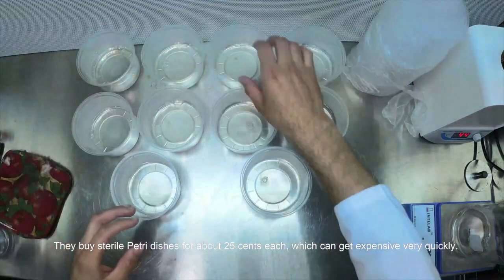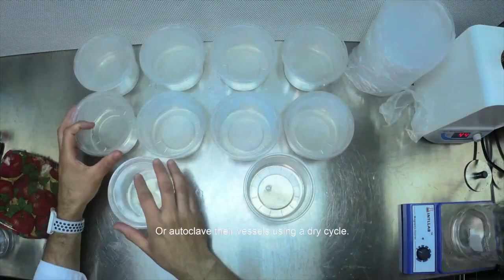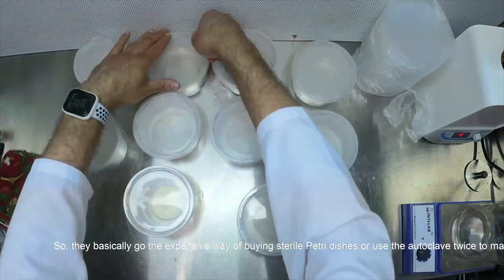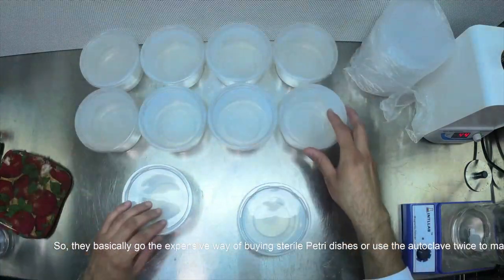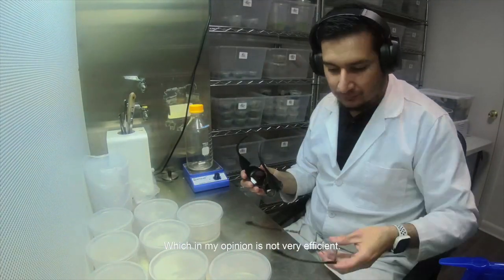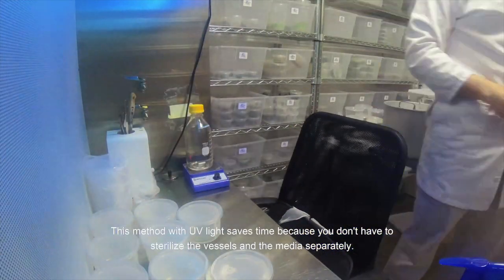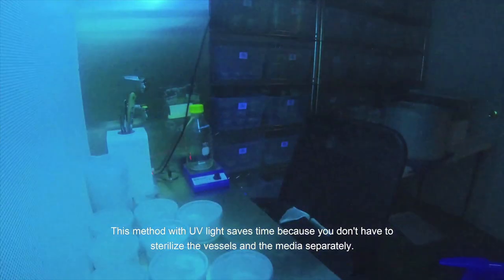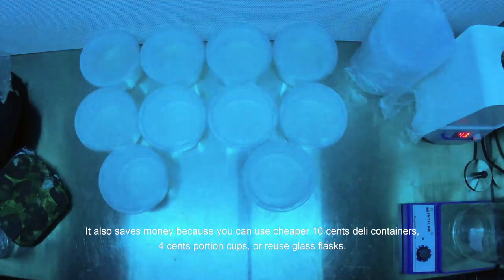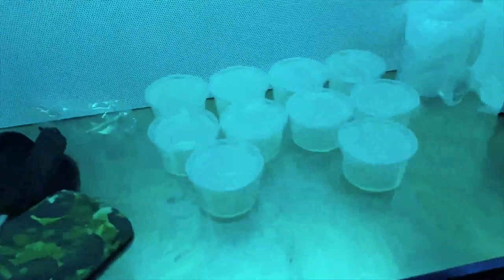They buy sterile petri dishes for about 25 cents each, which can get expensive very quickly, or they autoclave their vessels using a dry cycle. So they basically have the expensive way of buying sterile petri dishes, or use the autoclave twice to make media, which in my opinion is not very efficient. This method with UV light saves time because you don't have to sterilize the vessels and the media separately. It also saves money because you can use cheaper 10-cent daily containers, 4-cent portion cups, or glass flasks.